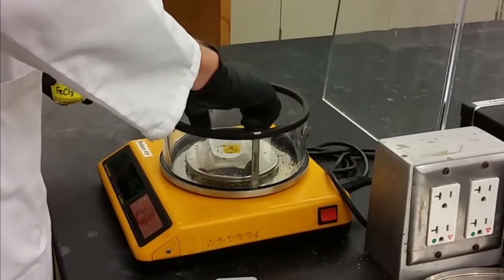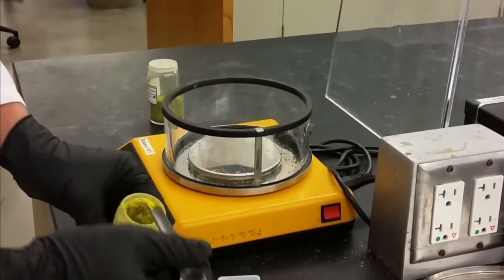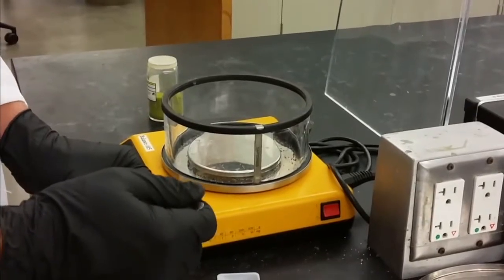In particular, make sure that you remove your weighboat before adding or removing the chemicals so you don't spill on the balance. And if you make a mess, clean it up.